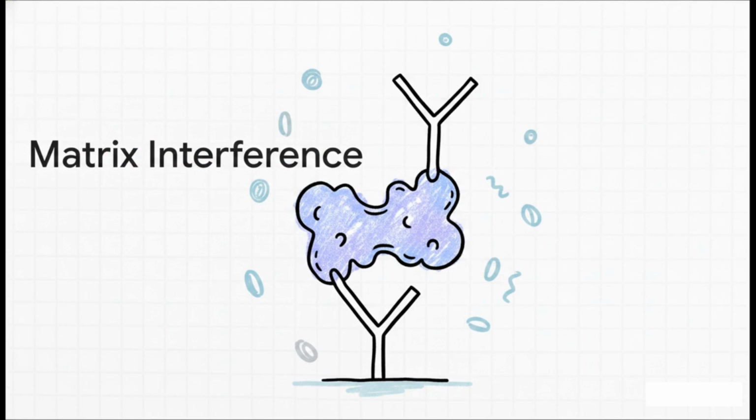But hey, it's not always a simple antibody problem. Enter endogenous matrix interference. Biological matrices like serum, plasma, and tissue extracts are incredibly complex soups of proteins, lipids, and complement factors. Things like autoantibodies, heterophilic antibodies, or human anti-animal antibodies are notorious here. They act as matrix-mediated bridges. Basically, they grab onto your capture and detection antibodies simultaneously, physically linking them together. To your plate reader, this mimics true analyte detection perfectly.